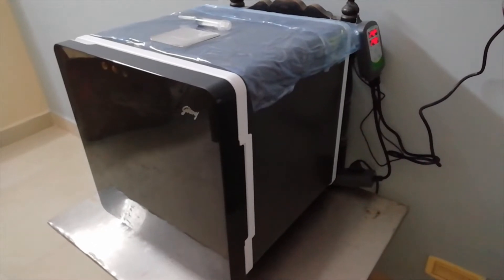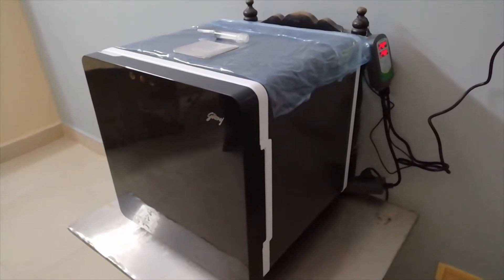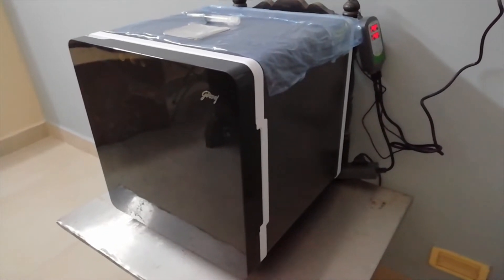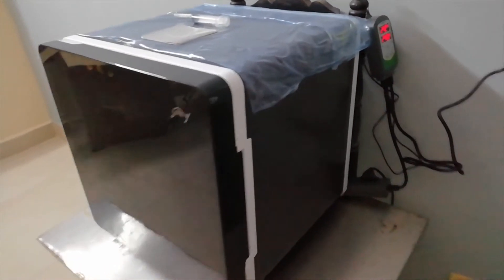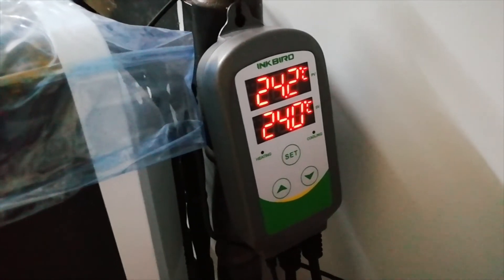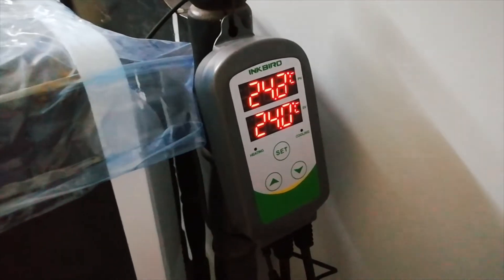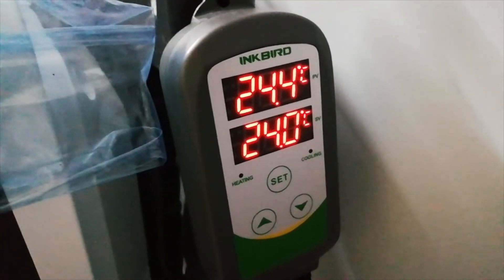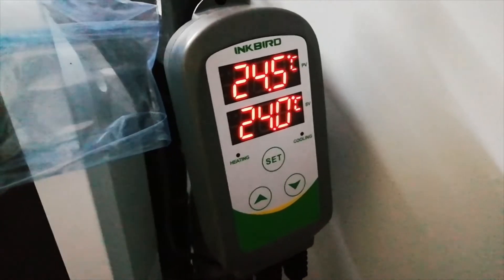Before starting the setup, I would like to give some details about the fridge and the temperature control. This is a Godrej 35-liter fridge — you can get it from six thousand five hundred to seven thousand rupees on Amazon. The Inkbird temperature controller is around two thousand five hundred to three thousand rupees. I am using this brand since it is more convenient, easy to set up, and more reliable.